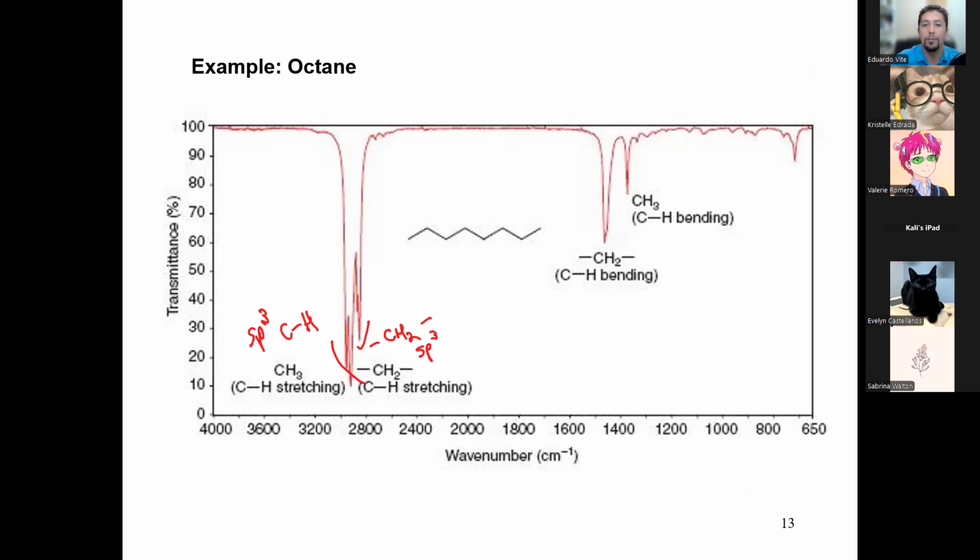Is there anything else? Well, it's a pretty clean spectrum. There's hardly any peaks. And again, at around 1500, we get our CH bendings. I don't see much of anything else. This one here is probably another CH bend of some sort. But that one's in the fingerprint region. We're not really going to pay much attention to it. It's also very weak. It could be anything really. So the absence of any other signals except the characteristic CH signals tells me this is just a plain old alkane. Make sense? So I guess you could call the stalactites a characteristic peak of hydrocarbons.